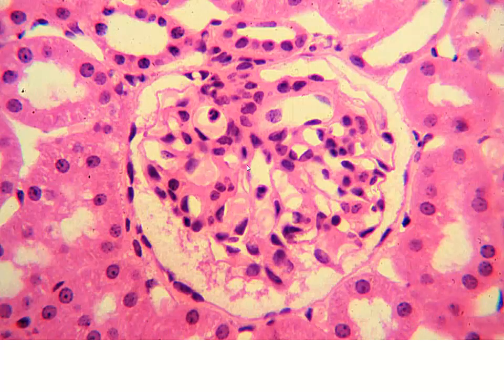Now, here's another view of our renal corpuscle. Once again, we start on the outside. We can see our parietal layer of Bowman's capsule, Bowman's space. We have our loops of our capillaries. We can't really see our afferent and efferent arterioles, but we certainly don't see our proximal tubule exiting. So we really can't see any of our poles, but this is probably going to be up near the vascular pole.